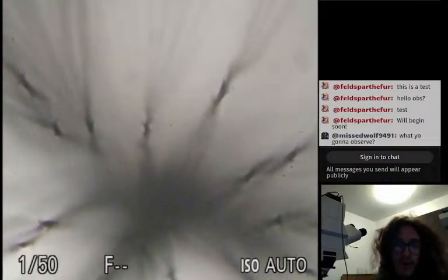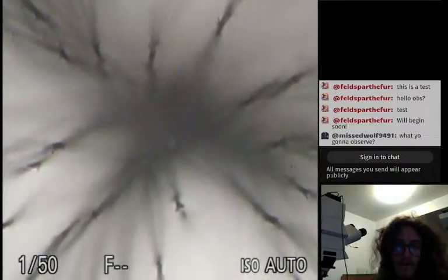Wow. I think that's worthy of a shot right there. Okay, let's look at the seed part at the bottom. Yeah, it looks the same as the wet sample.